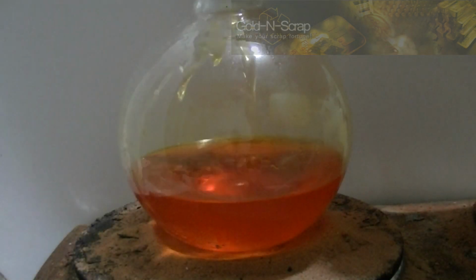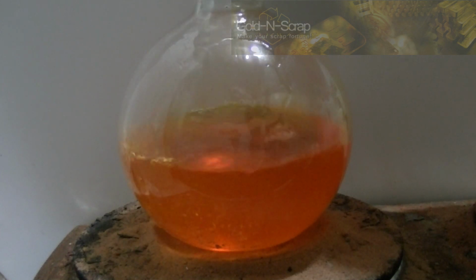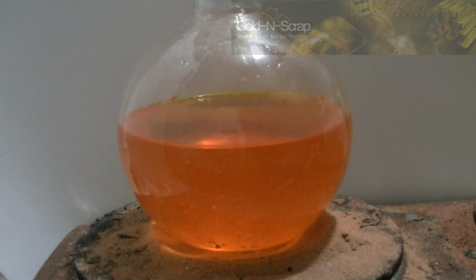When the dissolution of the gold is done, the solution is diluted 3 times over with water to precipitate the traces of silver chloride that was previously dissolved. Again, I forgot to film it, but a few milliliters of sulfuric acid were added carefully to the dilute gold solution to precipitate traces of lead, just in case there was any in the solution. The gold solution is left to stand overnight to cool down and precipitate silver chloride and lead sulfate.